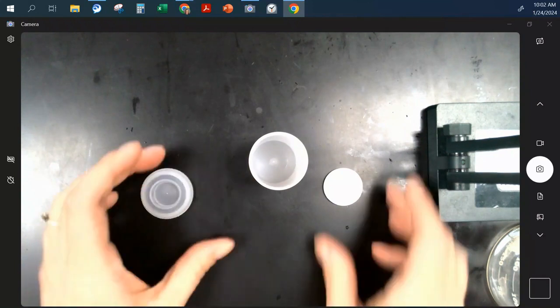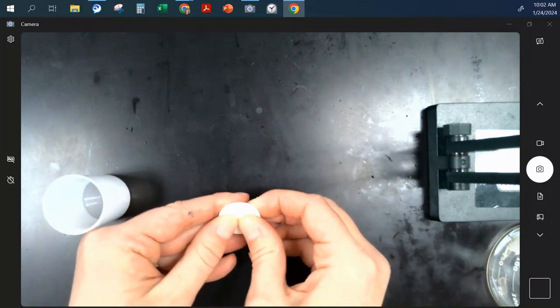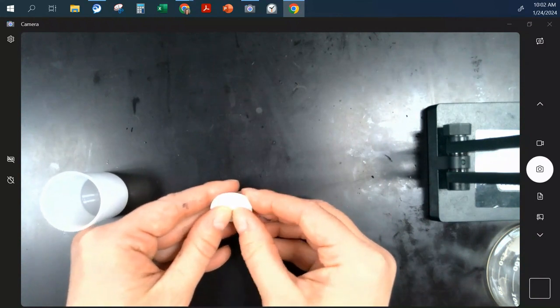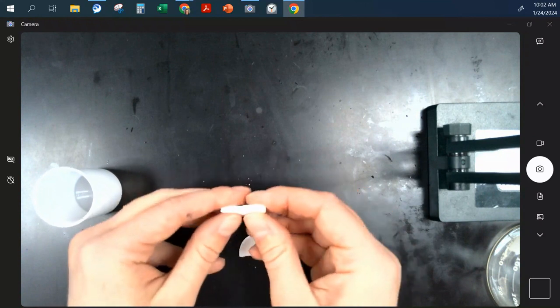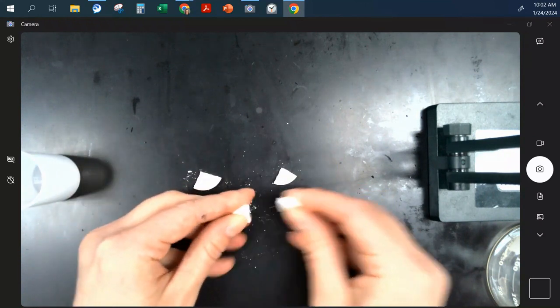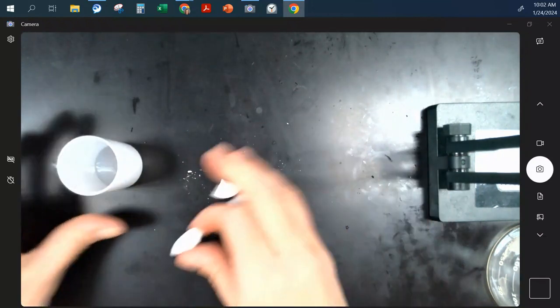Tablets. Okay, it doesn't tell you. So we have a lot of this. The video that I watched said that if you put a quarter in, it'll be a lot. So for this one, what I would do is take a quarter approximately. Maybe you can measure the weight or something. So I would take a quarter for each experiment.